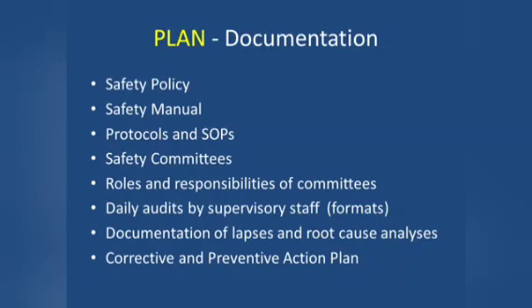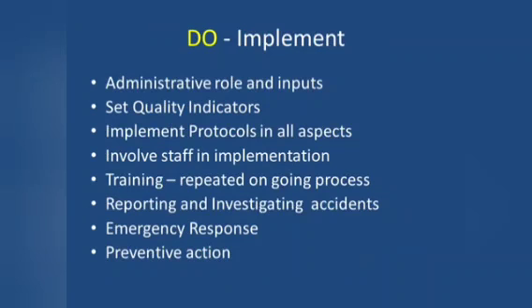After you have documented the lapses, you can have a root cause analysis and put in place corrective action and preventive action. The next part of the PDCA cycle is do. This is implementing what you have written down.